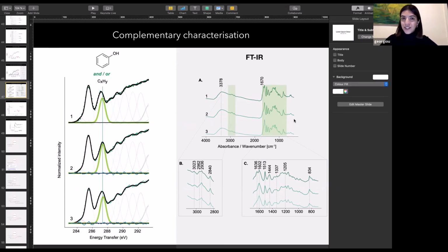I don't know if I tried again today, maybe at SSRL or at the ESRF, where they have these larger solid angle spectrometers, if I would obtain a signal after a long acquisition time. But when I did that with 4 crystal analyzers, I couldn't detect the organic phase of this bone black.